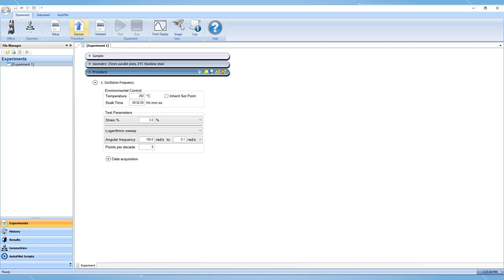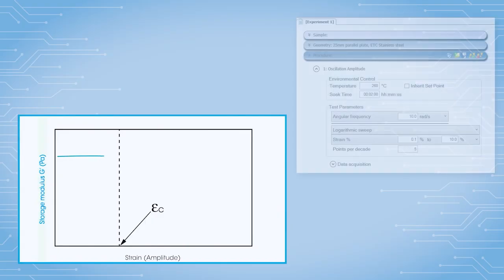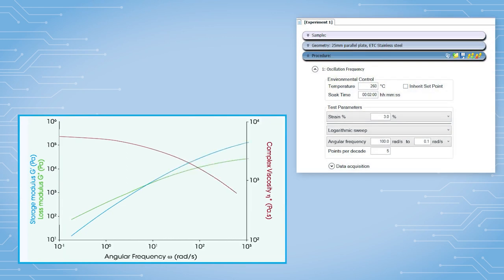Make sure that your method includes a soak time of at least two minutes so that the sample is equilibrated and relaxed prior to the start of the test. Typical melt rheology test procedures include an amplitude sweep to determine the linear viscoelastic region, a time sweep to evaluate the thermal process stability and the material stability at the test temperature, and a frequency sweep for viscoelastic characterization such as crossover frequency and crossover modulus, which can be subsequently used to calculate molecular weight and molecular weight distribution.